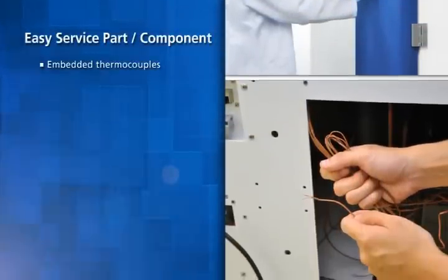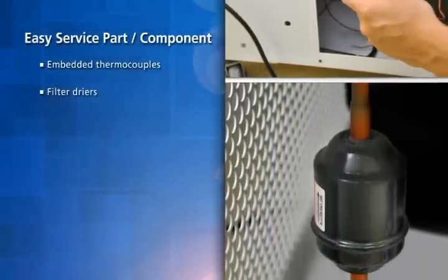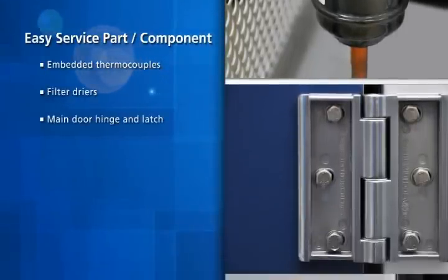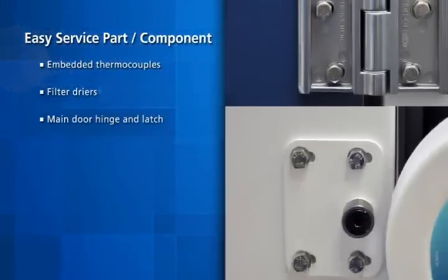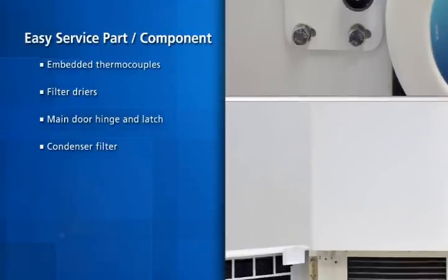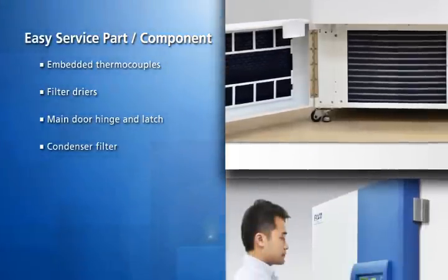Embedded thermocouples are incorporated for easy field troubleshooting. Filter dryers are located at the back for easy replacement. The main door features an adjustable hinge and latch. The condenser filter is conveniently located at the front of the freezer, allowing easy access for inspection, cleaning, and/or changing.